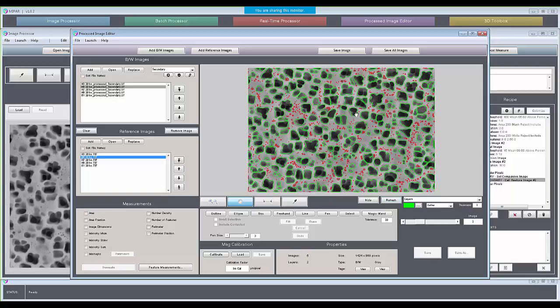So there's some communication between the two apps that lets you rerun a separate recipe on just some of the images. Usually, if an image is just terribly segmented, it's advisable to revise its recipe rather than manually fix all of those things. But it's a case-by-case thing.